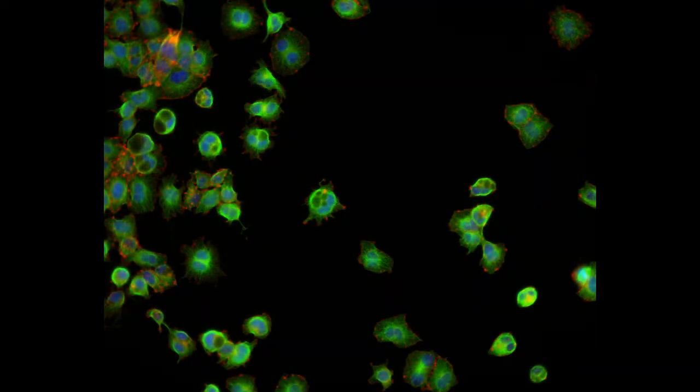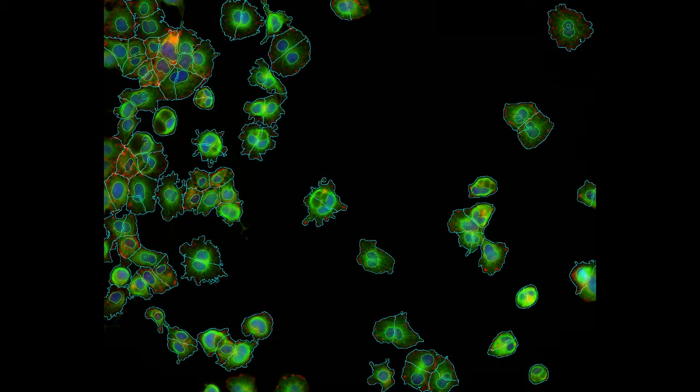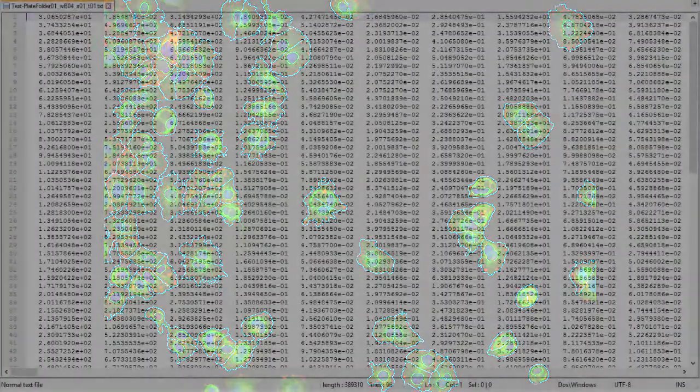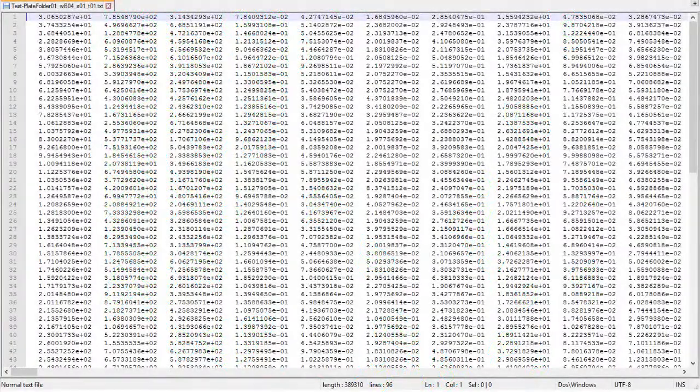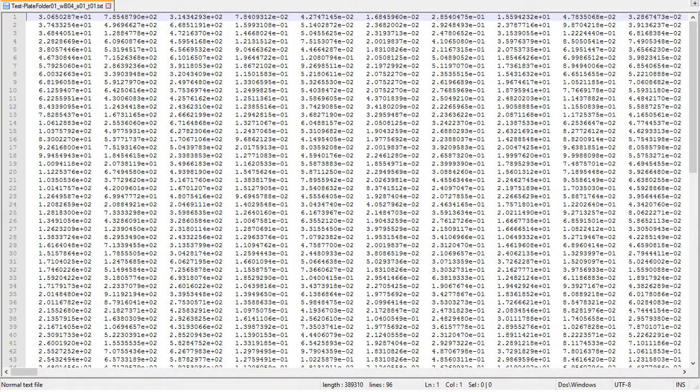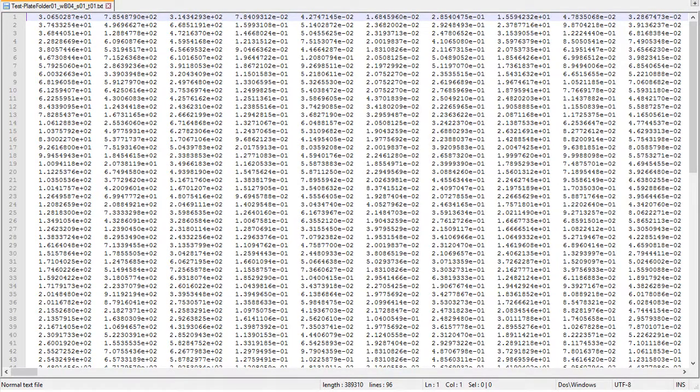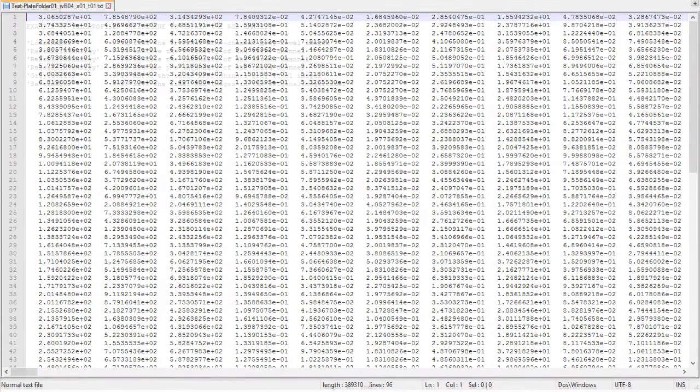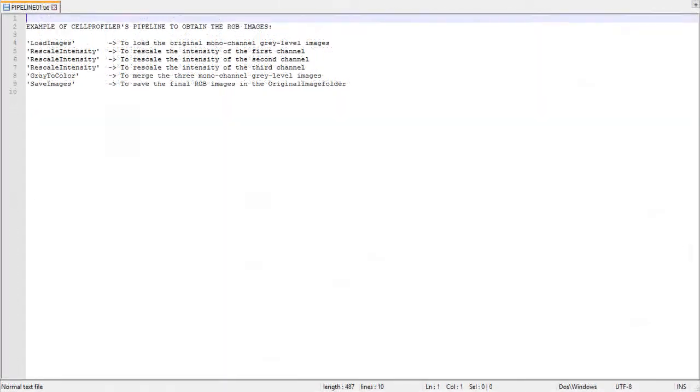The RGB images to be visualized, obtained by merging together the original monochannel images. The contour images, obtained by overlaying contours on the RGB images just mentioned. And metadata files that contain the numerical feature values of each cell. Let us see how to obtain these files. The original RGB images to be shown in Advanced Cell Classifier can be obtained by simply merging the single original monochannel images.